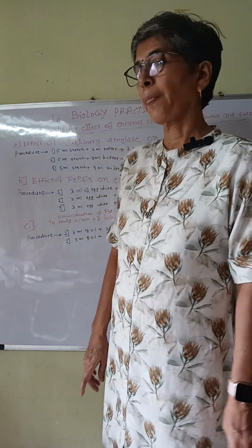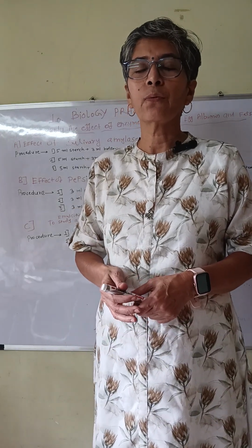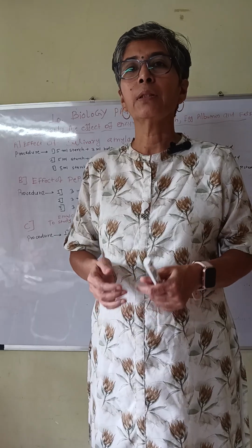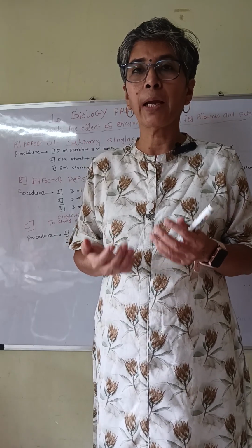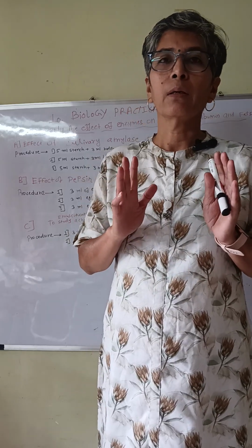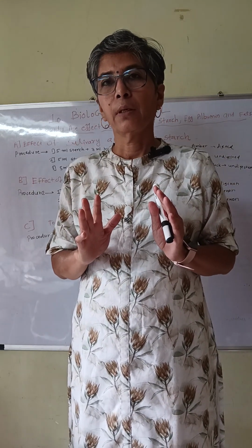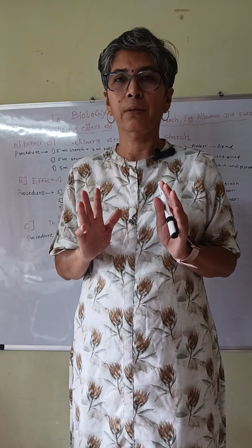After this, there is the incubation process of the 3 test tubes. Incubate these 3 test tubes for 15 minutes at optimal pH 6.7 and at 37 degrees centigrade.